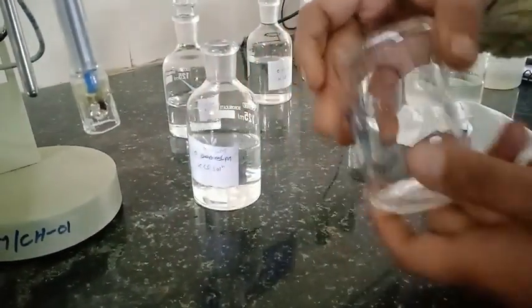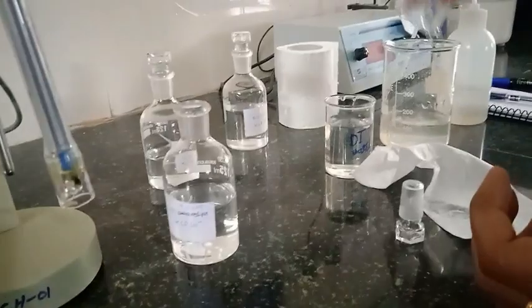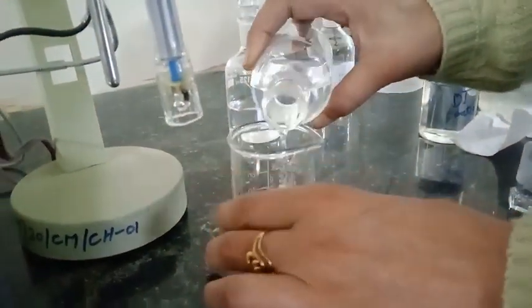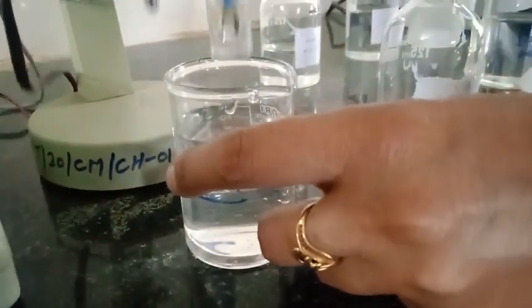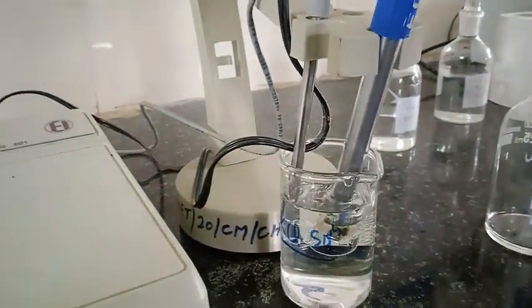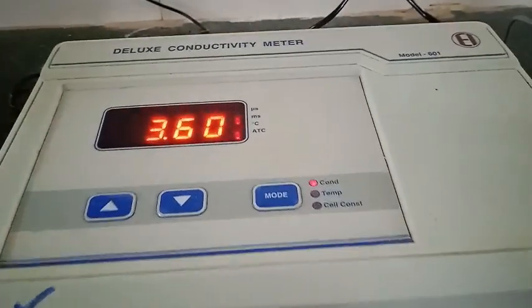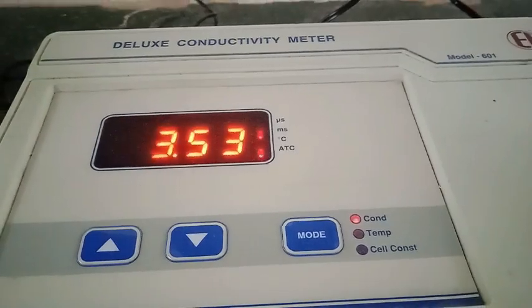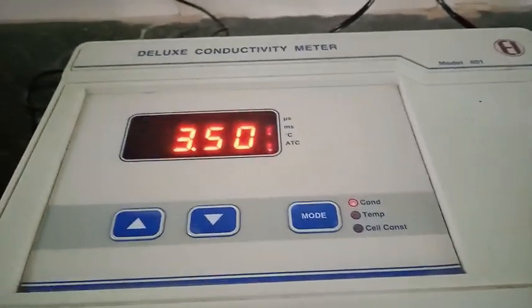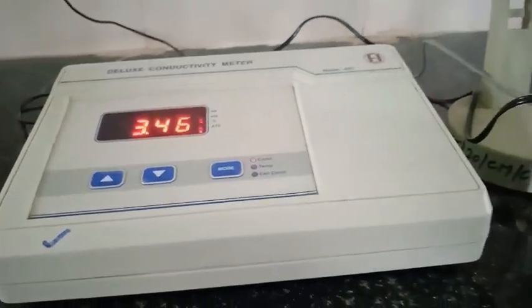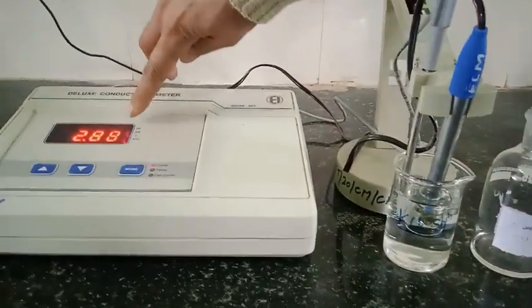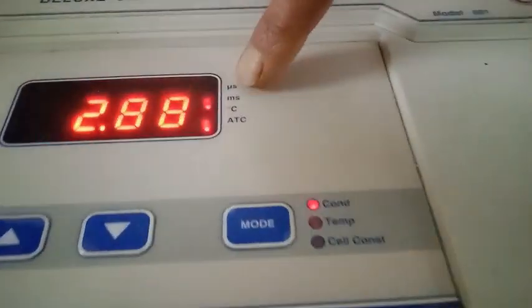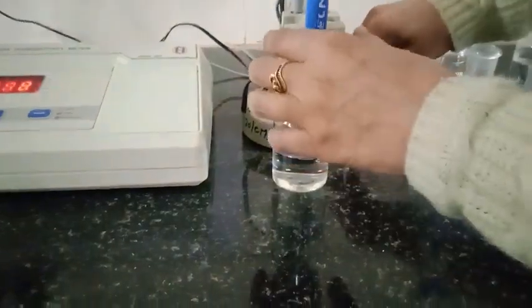The reason we rinse is that in the earlier solution we had a higher concentration, so rinsing dilutes any residual. Now I transfer the whole 0.02 molar solution into the beaker and dip the conductivity cell as well as the temperature probe. This is important while measuring conductance — the cell must be at the center and should not be near the walls of the beaker, because that can affect the reading. After waiting for stabilization, the reading for the 0.02 molar solution is 2.88 millisiemens — the millisiemens LED is blinking.